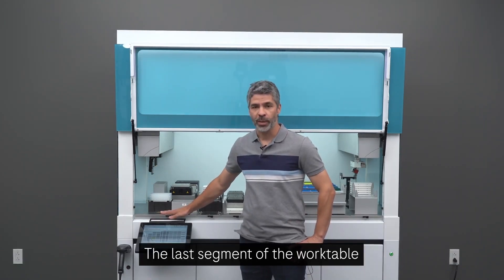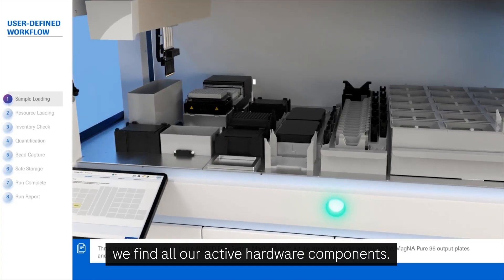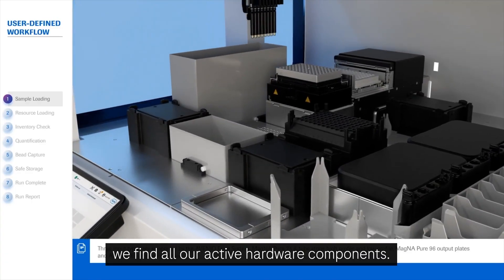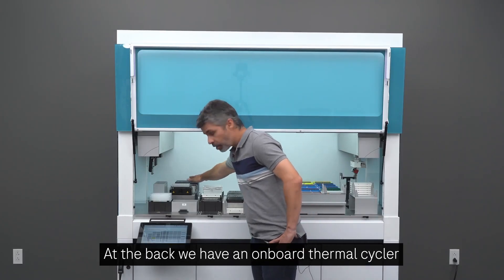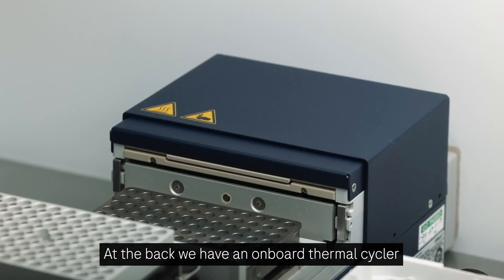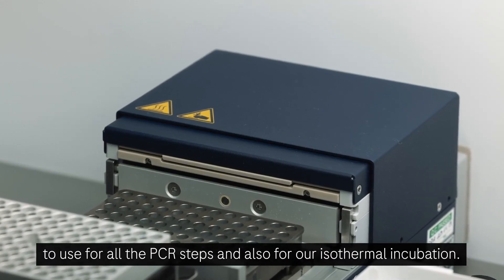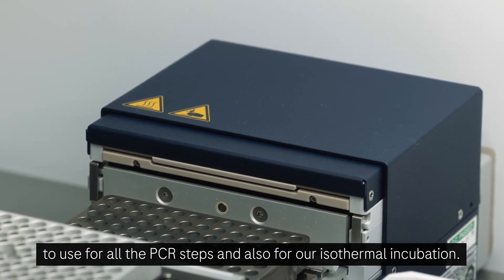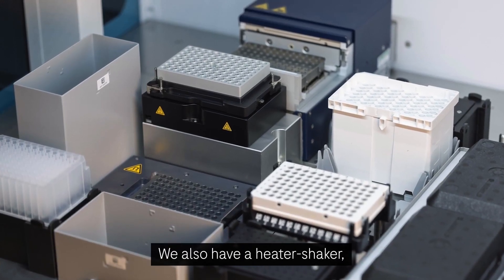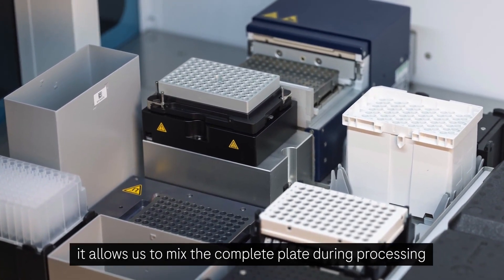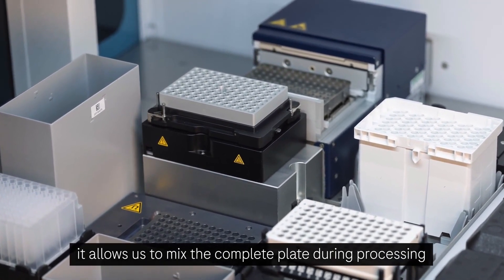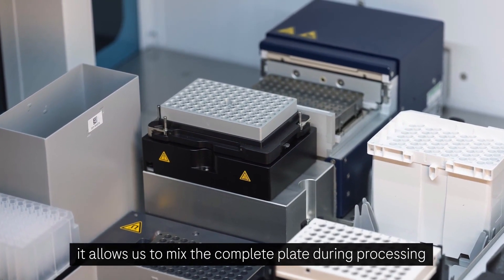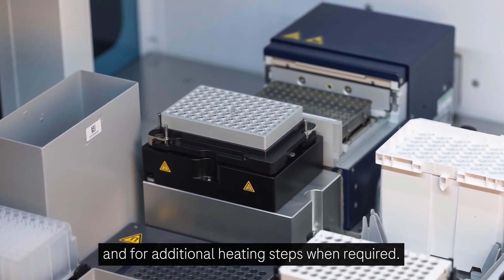The last segment of the work table, we find all our active hardware components. At the back, we have an onboard thermocycler to use for all the PCR steps and also for our isothermal incubation. We also have a heater shaker that allows us to mix the complete plate during processing and for additional heating step when required.